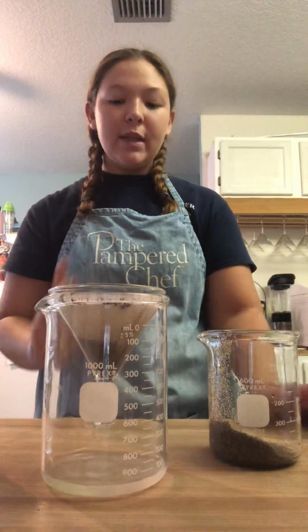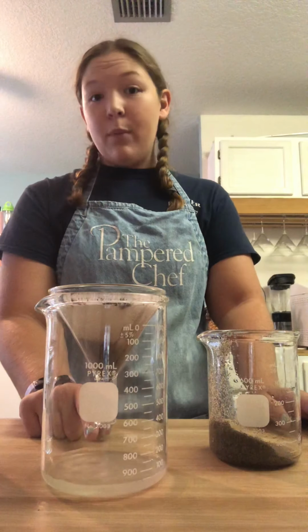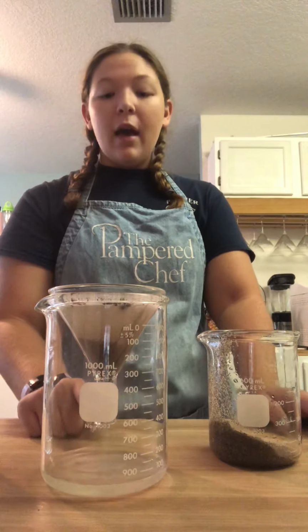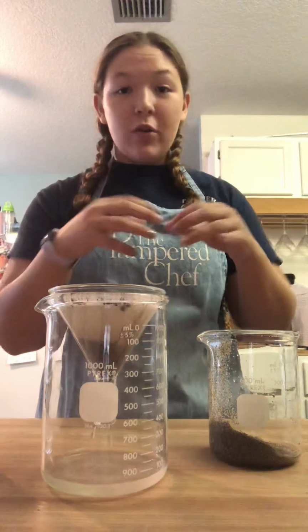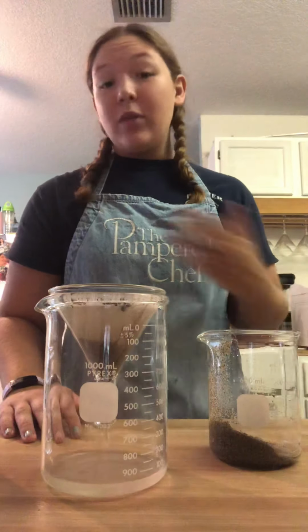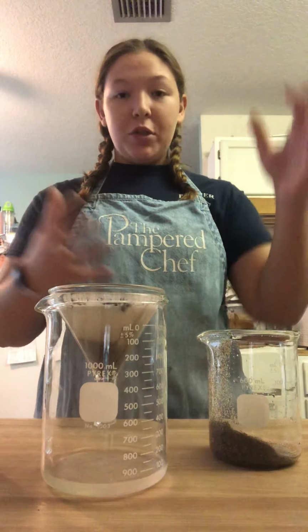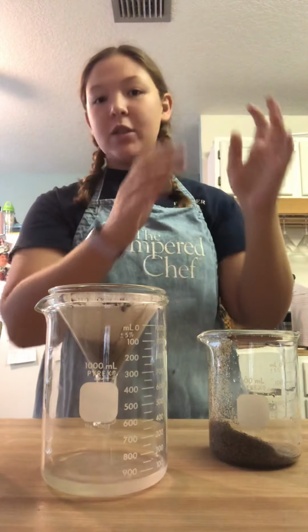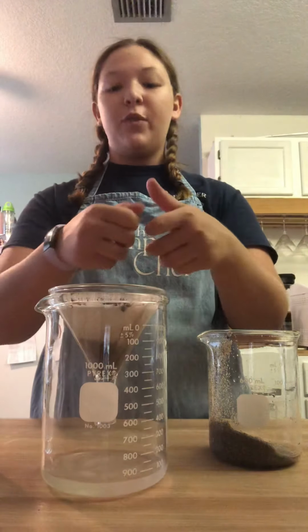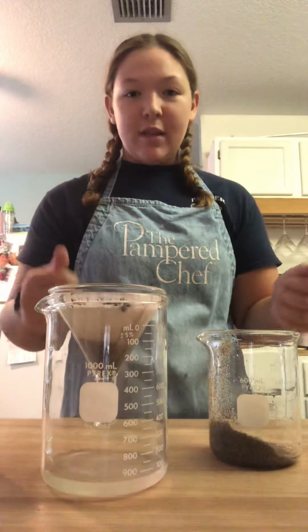And then we are going to take the water that is in the beaker and we would put it on a hot plate or a Bunsen burner, and that would allow us to boil the water. Now, in order to keep the salt crystals in, we would use something for a watch glass. I will not be demonstrating that, but this watch glass will allow the salt crystals to form on the top of the watch glass and not escape into the air. And then on top of that watch glass, we would have put the sand to dry, and then we would weigh those separately.